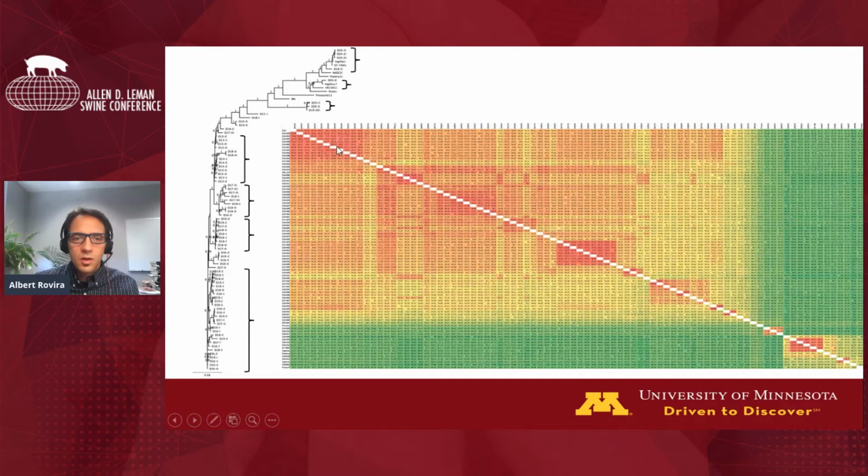And then as you go down and to the right, you will see some more spots that are red. Those are other clusters of strains that are very similar. And then to the bottom right, you'll see a couple of small groups of strains that are similar. Those are the vaccine-like sequences that are similar to each other, but they are not similar to anything else. So another way to represent this, we're creating a lot of information that hopefully is going to help us with the new outbreaks, just to go beyond the ORF5.